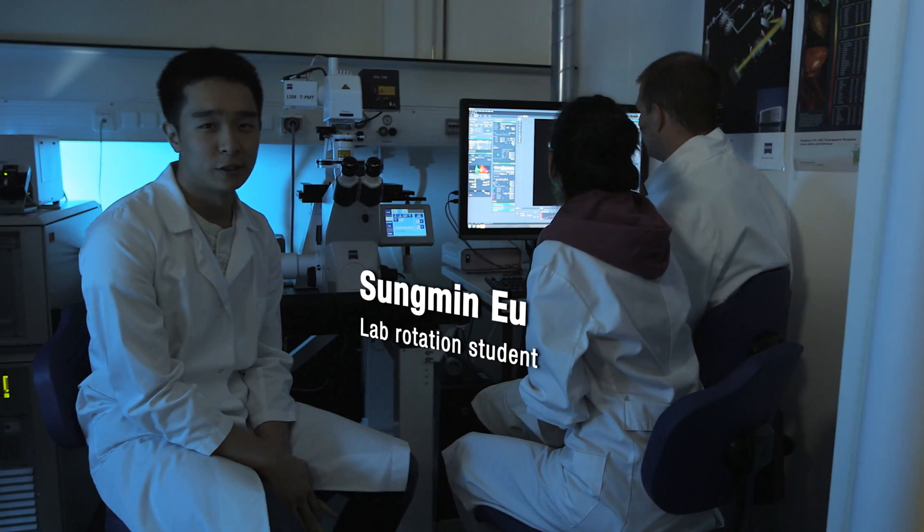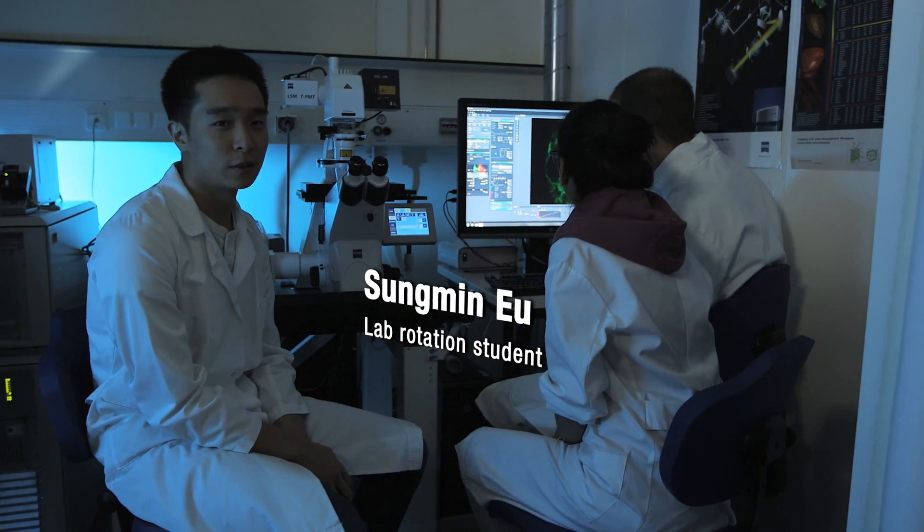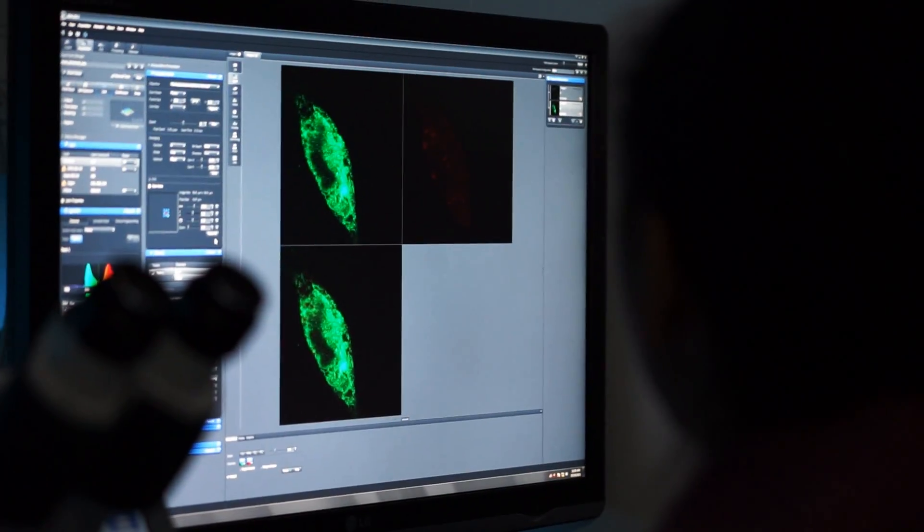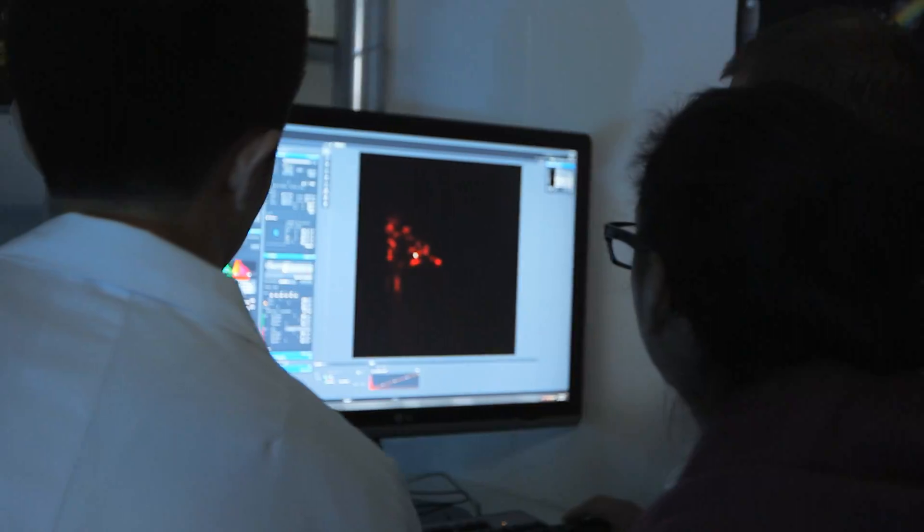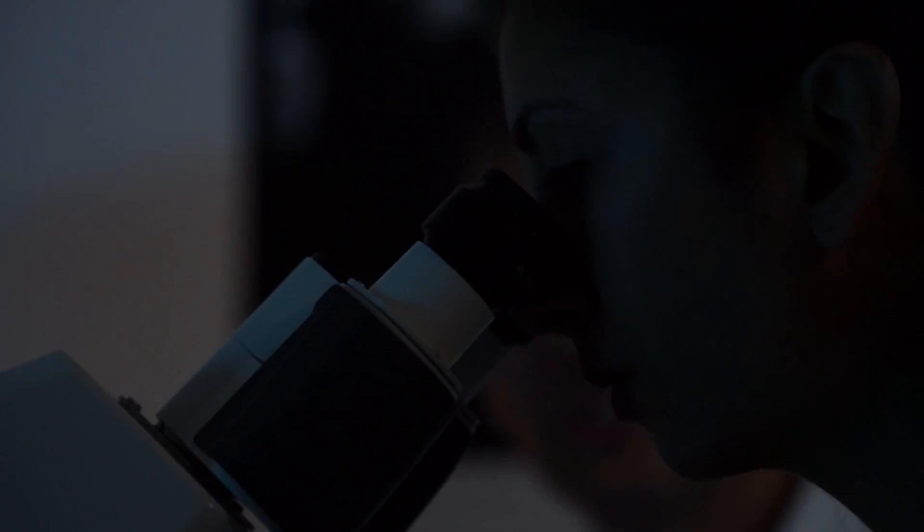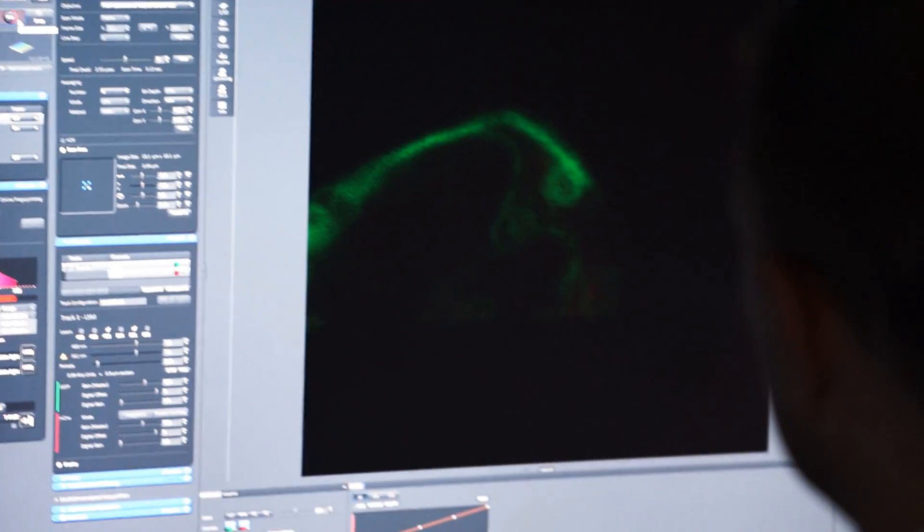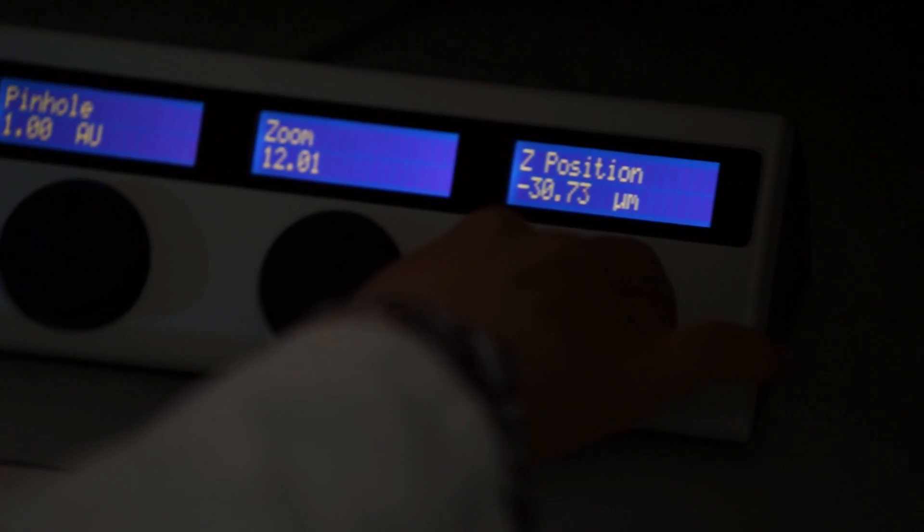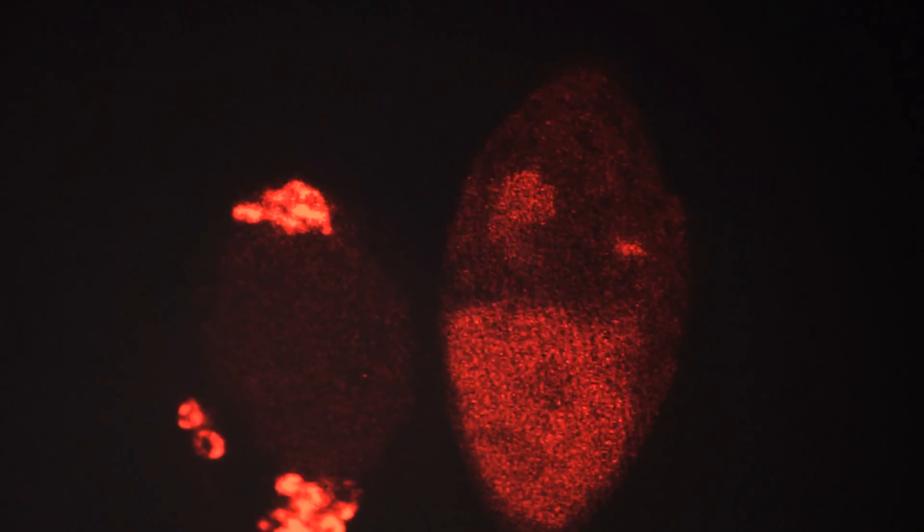One of the great advantages in ZMBH is that we have access to such great microscopic technologies. The light microscopy core facility here at the ZMBH provides for our researchers the instrumentation to do advanced light microscopy. We can resolve structures up to a millionth of a millimeter and observe what is really going on inside cells in real time.